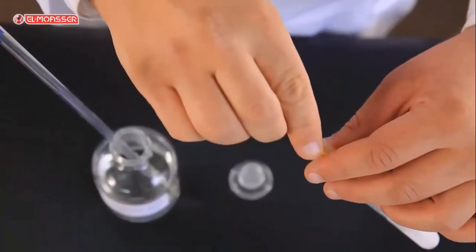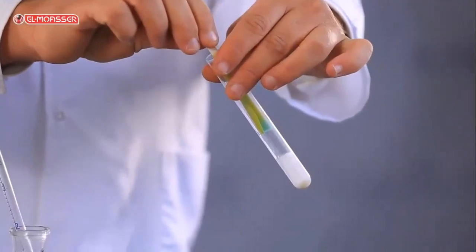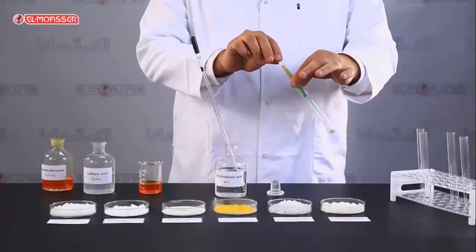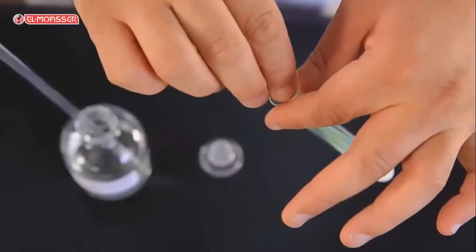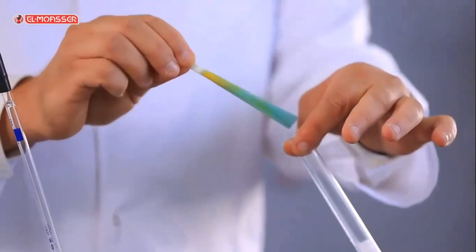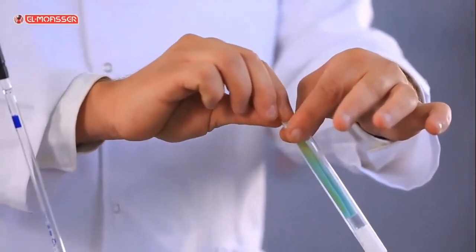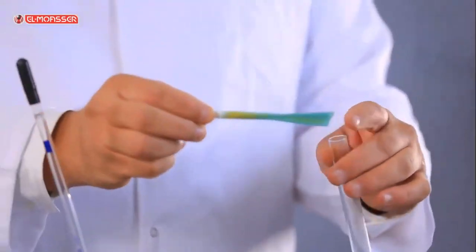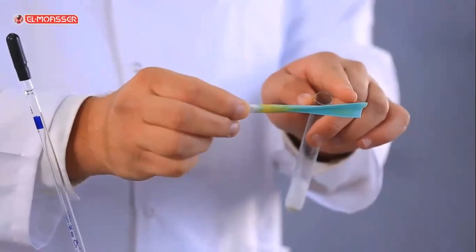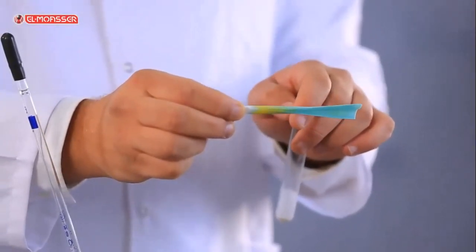To test the evolution of sulfur dioxide gas, which has a pungent smell, approach a paper wetted by acidified potassium dichromate. What do you observe? The orange color changes into green color because potassium dichromate is reduced by the gas into green chromium 3 sulfate.